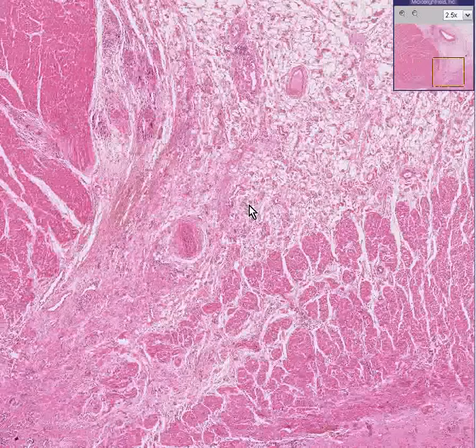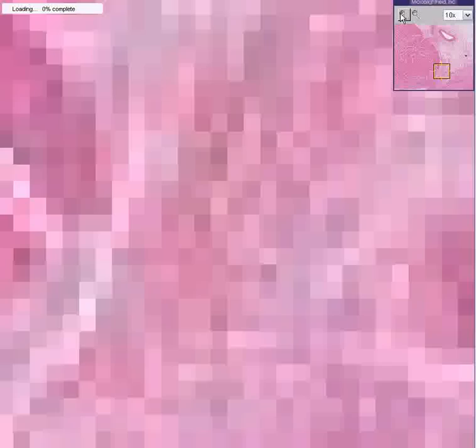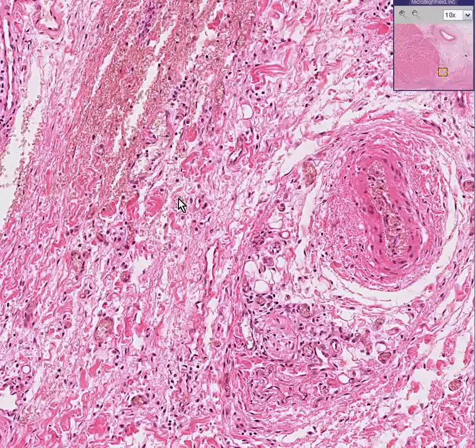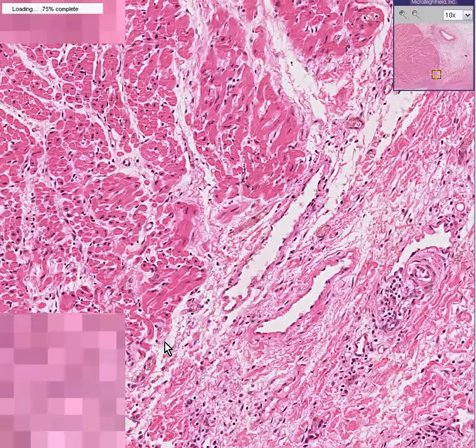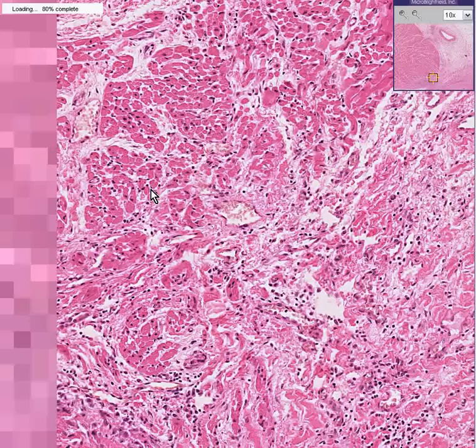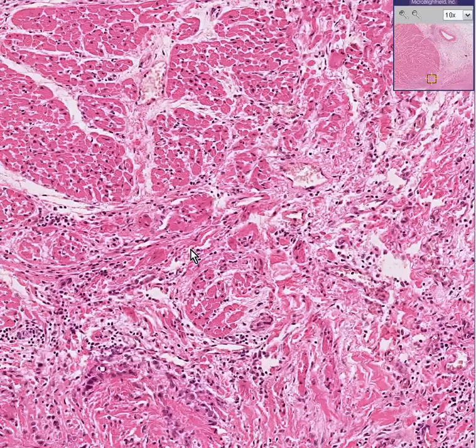There are infiltrates of chiefly chronic inflammatory cells and macrophages within the fat, within the edge of the myocardium. And here we can see an area where it has been going on for some time, because there also appears to be some fibrous tissue as well.